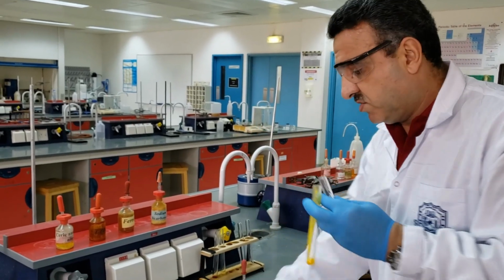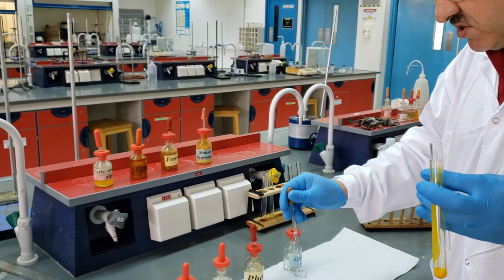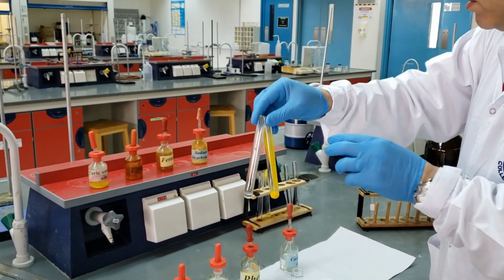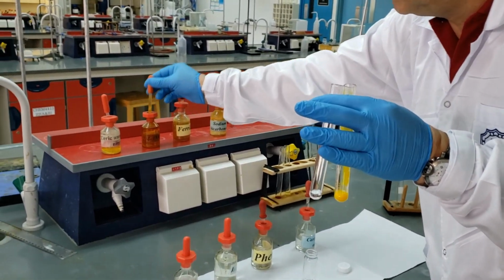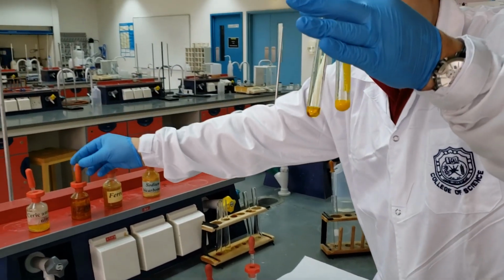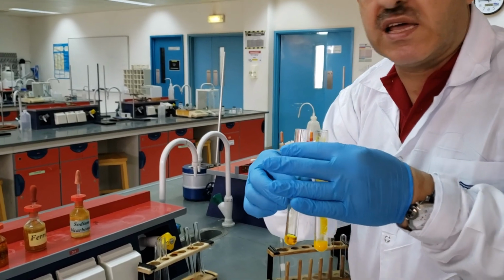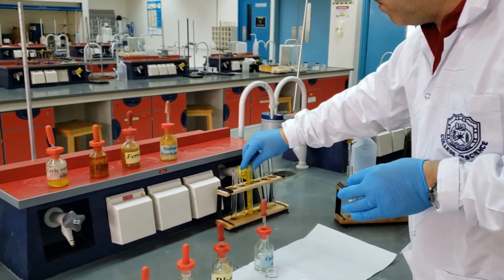Now, to check if our unknown compound contains the same functionality or not, we add just 1 milliliter. Then we add the same reagent, and you can see it does not give the same change in physical property, does not give a precipitate like the ketone, which means our unknown compound does not contain ketone functionality.